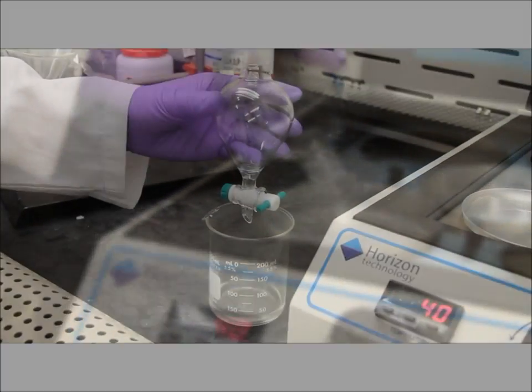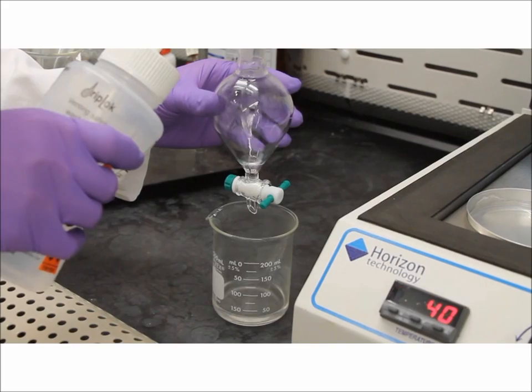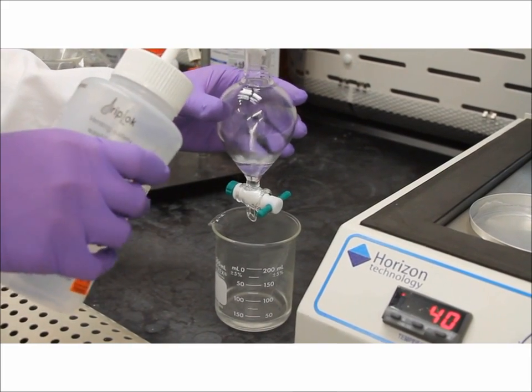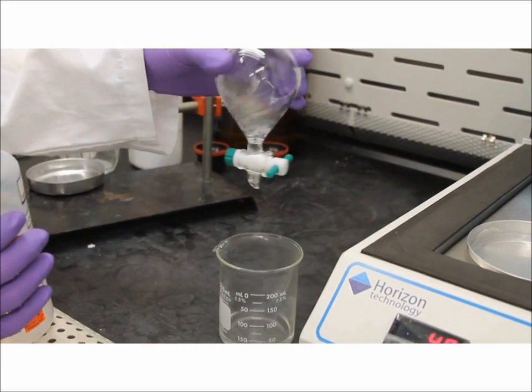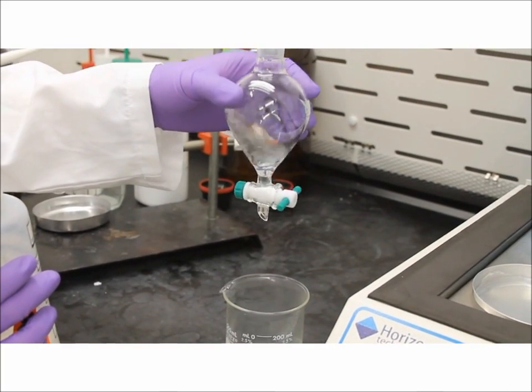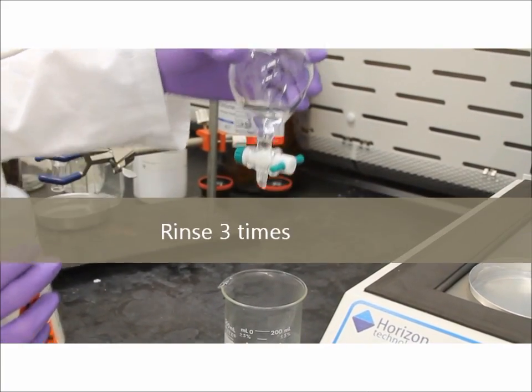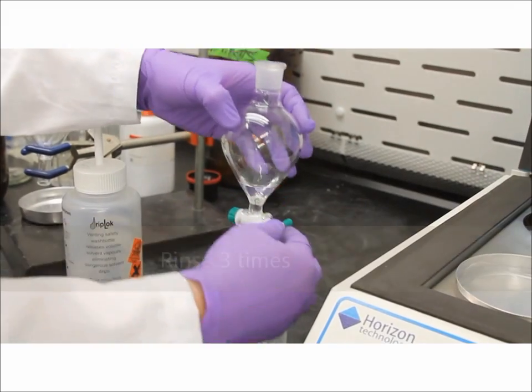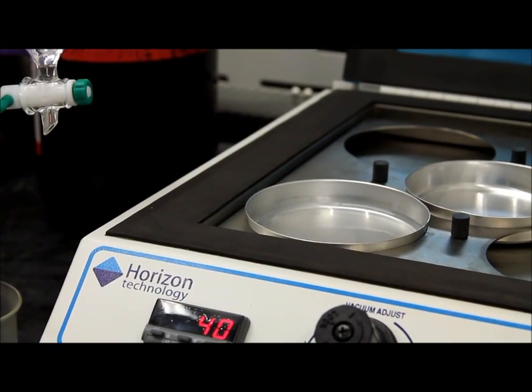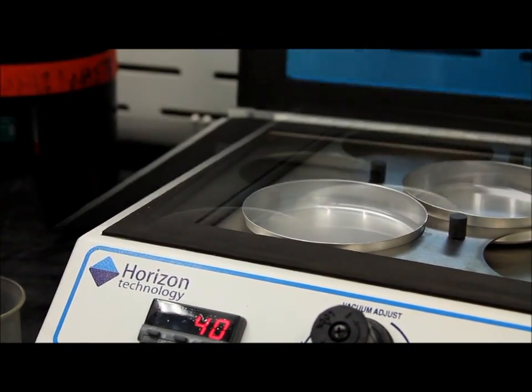Now rinse the collection vessel with a small amount of solvent and swirl it around to capture all of the compounds to achieve the highest recoveries. Remove the excess water from the bottom. Pour this now into the pre-weighed pan and repeat. You want to make sure that no excess water is poured into the pre-weighed pan.